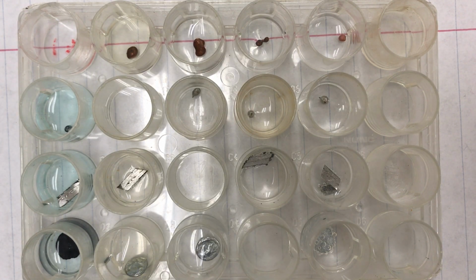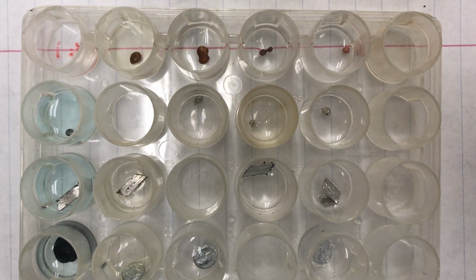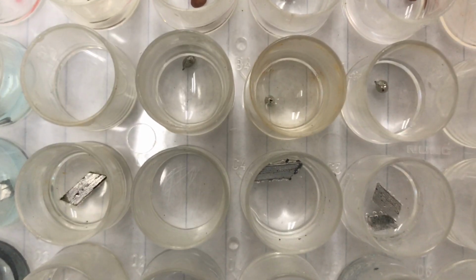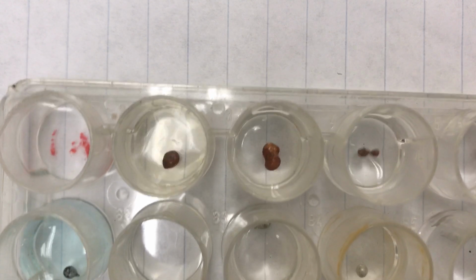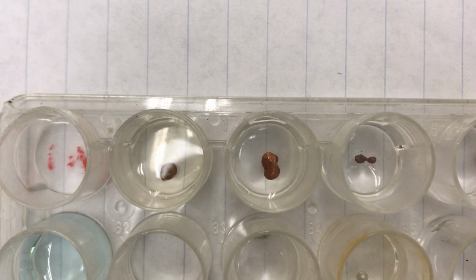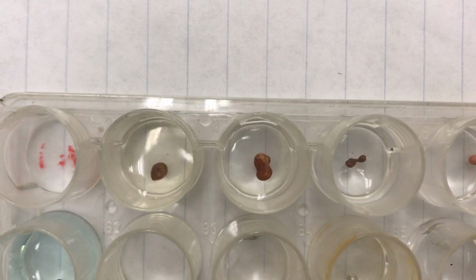Alright, so it's been about 5 minutes. Let's take a closer look here at each of our rows. Alright, so let's start here. Row A, you can notice any changes that may have happened.